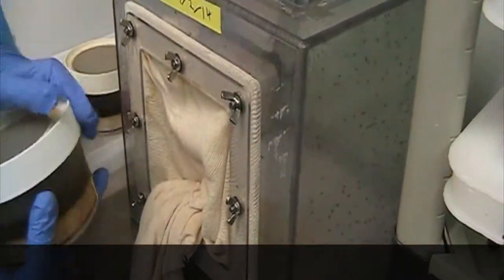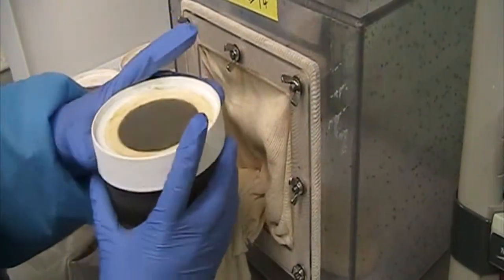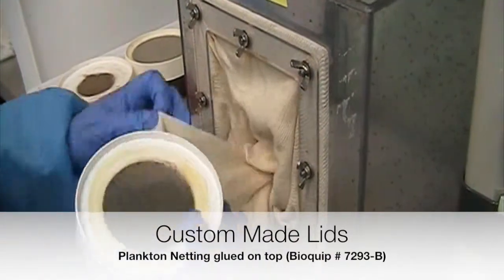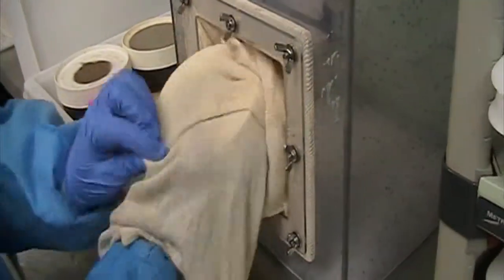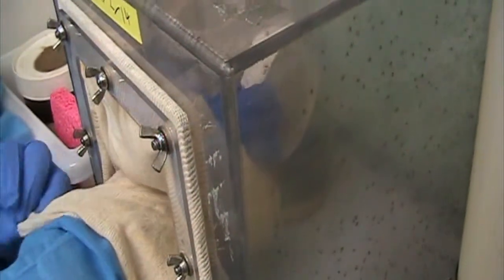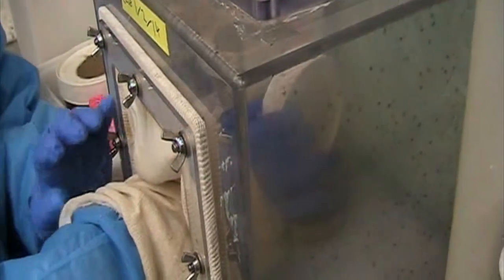We grab one of the pots and open it up outside the sleeve, but only until it's very loose so we can smoothly take the lid off once it goes inside the cage. Now that I'm inside the cage, it's very important that we open it slowly and tap the lid inside the pot. This is so we won't lose any material — any of the pupae on the lids or any of the pupae around the pot.